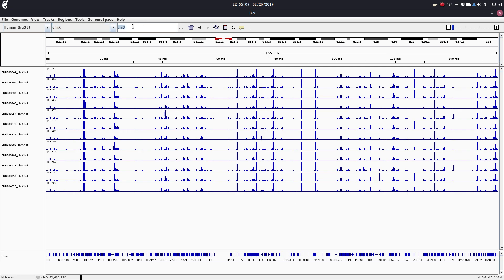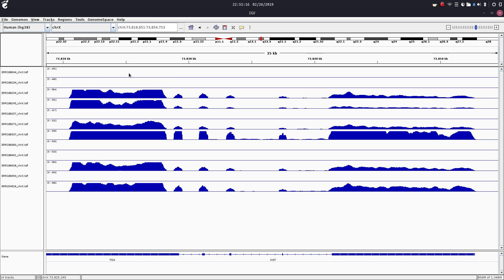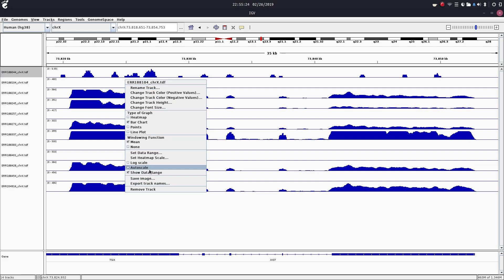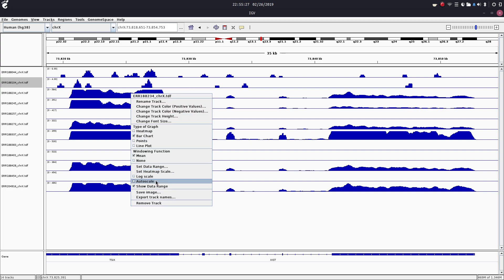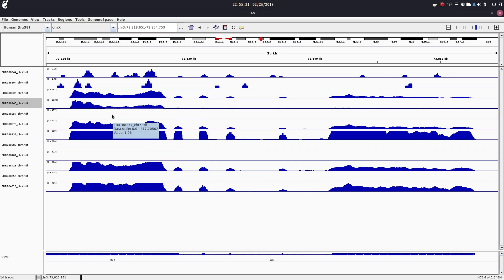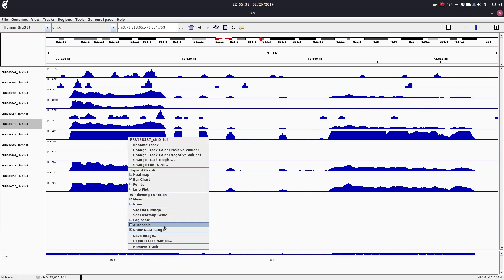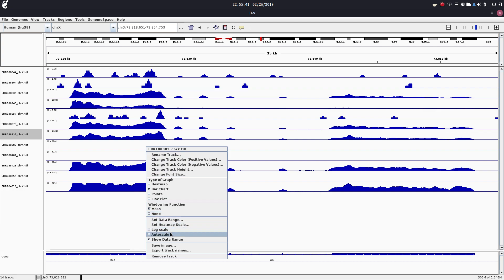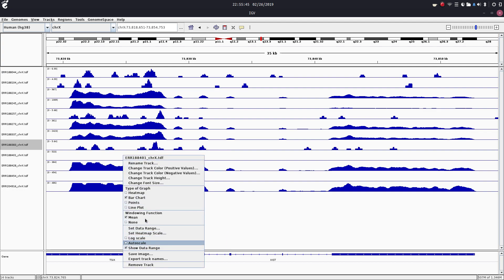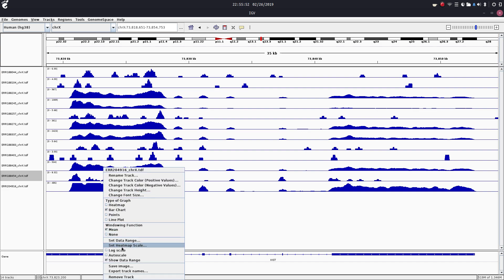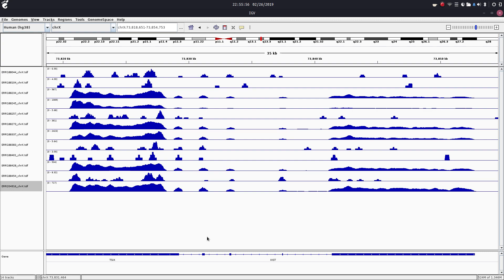Let's check out the ZYST gene. We're going to zoom in on the ZYST locus. We're going to click auto-scale on each one — auto-scaling all of these to make them look nice and pretty. As we auto-scale some of these, they come into view and shrink so that you can view them better. And there we have it — completely auto-scaled and zoomed in on the ZYST gene.